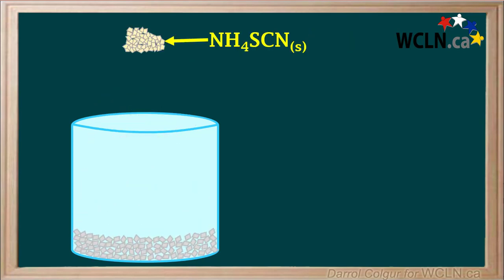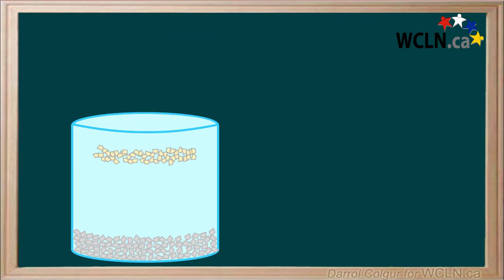Next we'll add some solid ammonium thiocyanate to the beaker, so we have a mixture of the two solids.